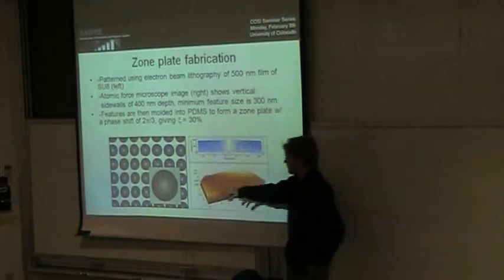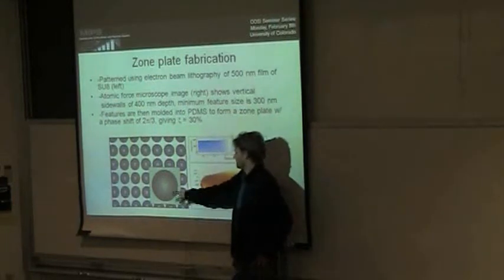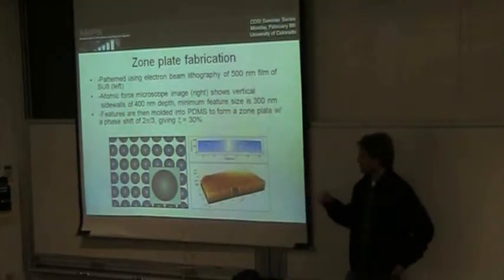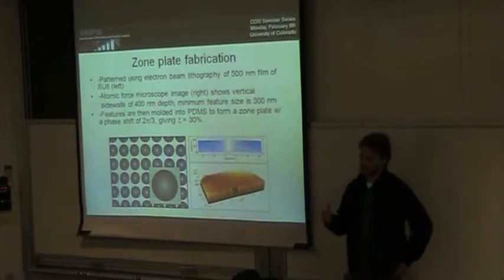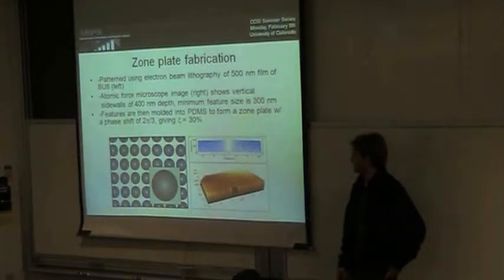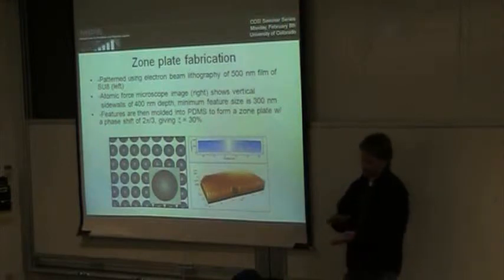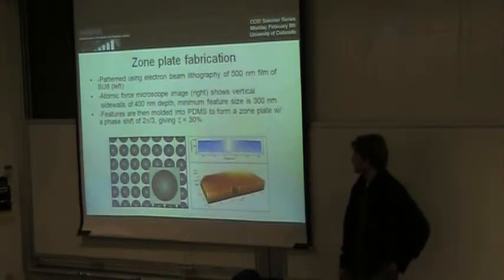If you make a very large lens array, it can take as long as several hours to write that pattern with the E-beam, but once you've made your master, you can mold it many times. And you can even use the molded lens array several times. We'll talk a little bit about how we align and adhere that to the microfluidic system.